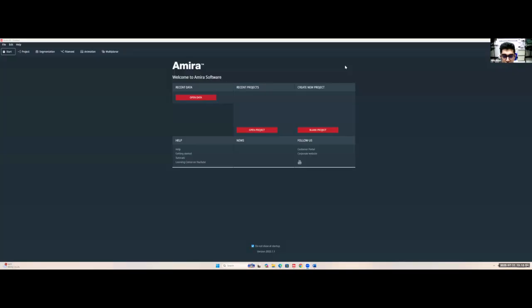All right. Hello. This is going to be a video guide for using Amira to segment our 3D volumes. This is going to be largely based on Mihir's Guide to Amira document, but I'll include some more information in this about keybinds and some neat tips and tricks so you can follow along with the document.